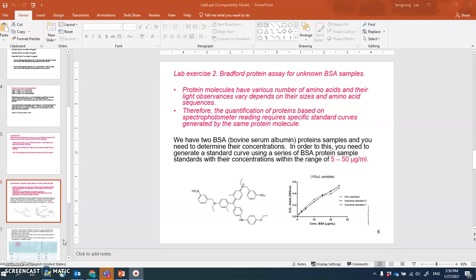Okay, so that's why there are 3 different color chromogenic reagents that you can add to your protein before your protein is quantified, and then those chromogenic substances will better absorb the visible light. Since those chromogenic substances will bind with the protein at almost an equal ratio, the concentration of the chromogenic substance will correlate with the absorbance of the visible light in the spec.